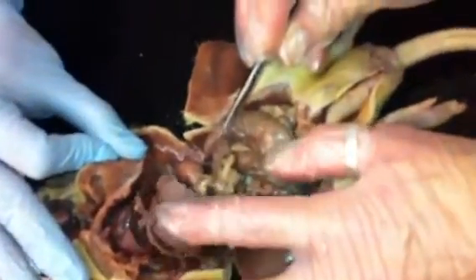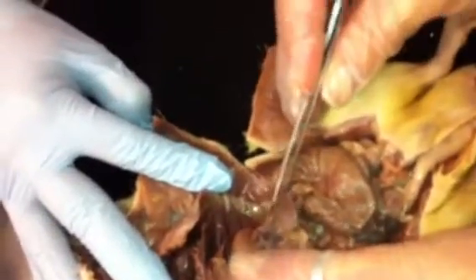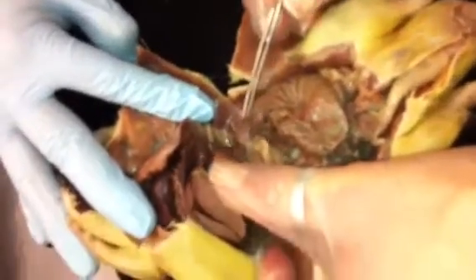And then here, what we're looking at mostly kind of looks like a big mess, but I'm going to pull this over to the side so we can look at the left side of the rat. And this organ here is the spleen. A lot of people confuse it with the liver because they're really similar in color, but if you notice, the spleen is below the stomach and appears to be coming from the back, and it's actually detached from the liver, so they're not the same organ.